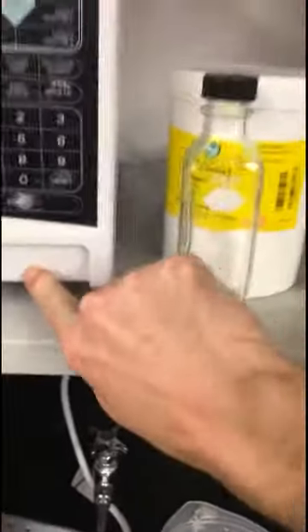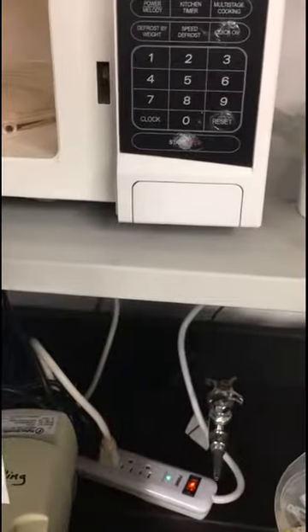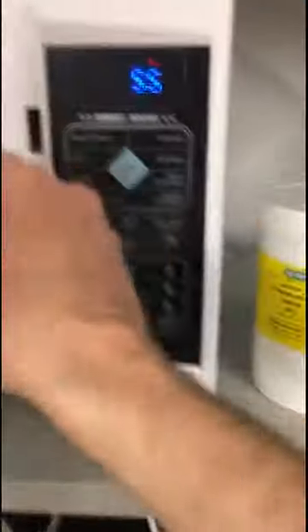We're going to microwave this to melt it. I recommend you take the top off and just put it back on, but not tighten it at all — basically take it off and just leave it resting on top.